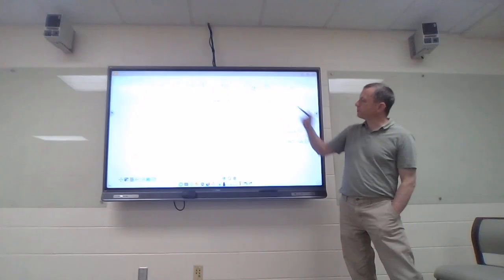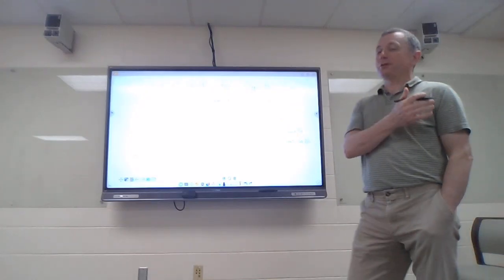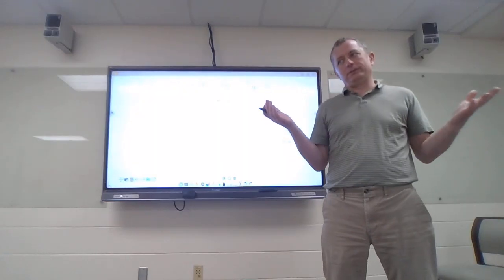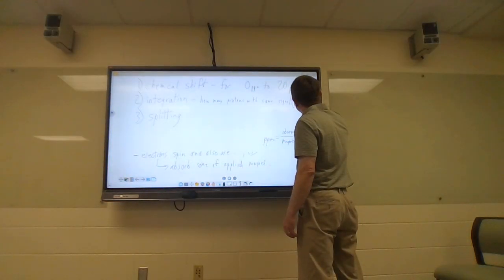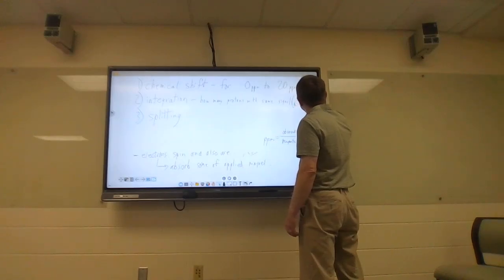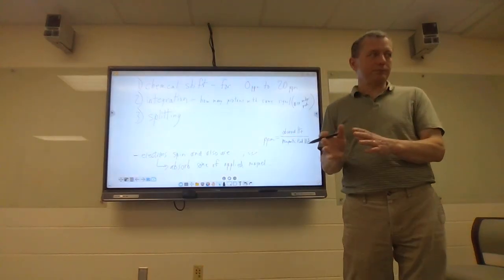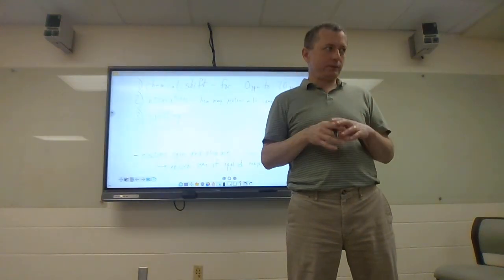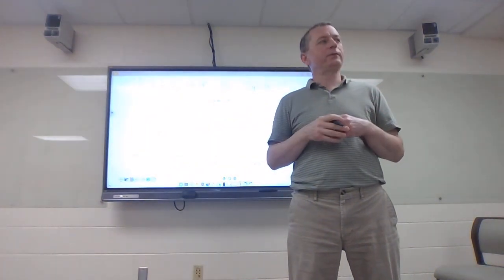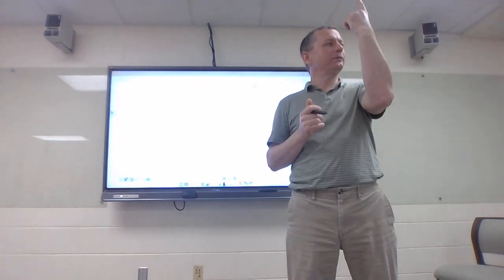Okay. So it tells me how many protons have the same signal. And then integration is literally integration. It is relative. It is the area under the peak. You can't really integrate some of the other spectra. You can certainly integrate a proton spectrum, but it's all relative. And what you're going to find out is the more hydrogens there are, the bigger the peak.